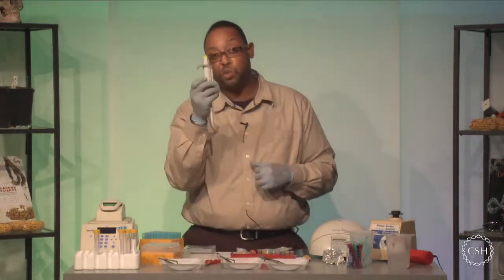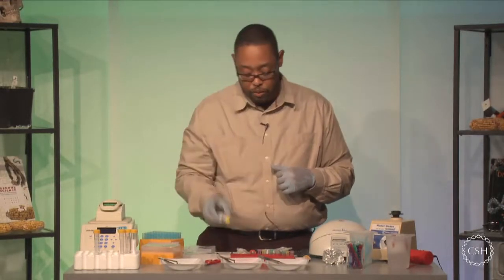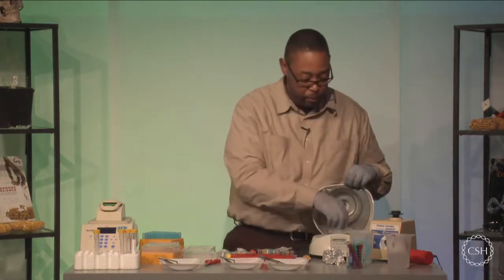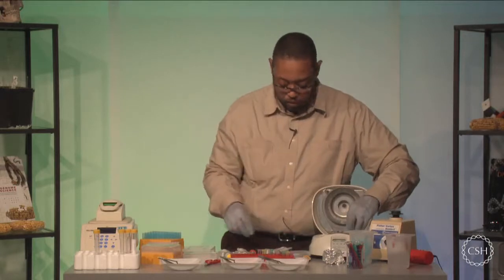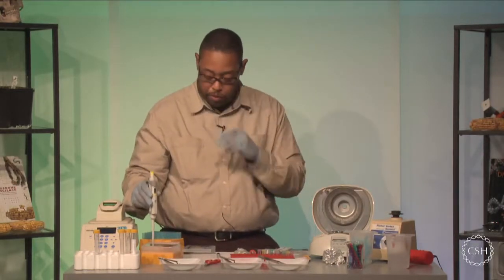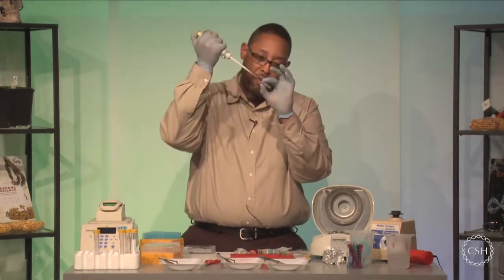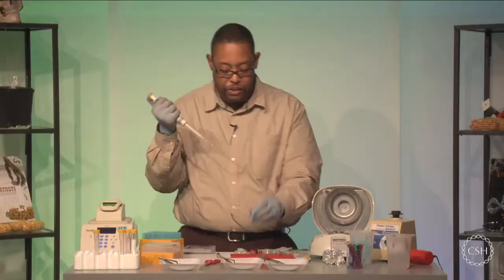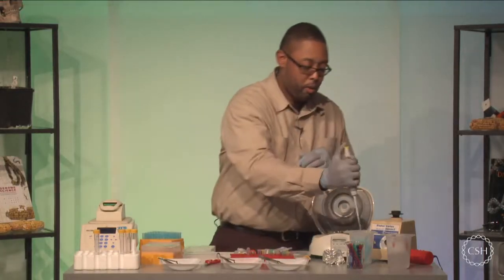At this point, I would like you to switch to a P100, which is going to allow us to get a smaller tip in there and remove the smaller amount of liquid. My pipetter here is still set to 100 microliters, my P100. And I'm just going to remove that tiny amount of liquid that still remains there and then allow this to sit at my bench with the test tube open.